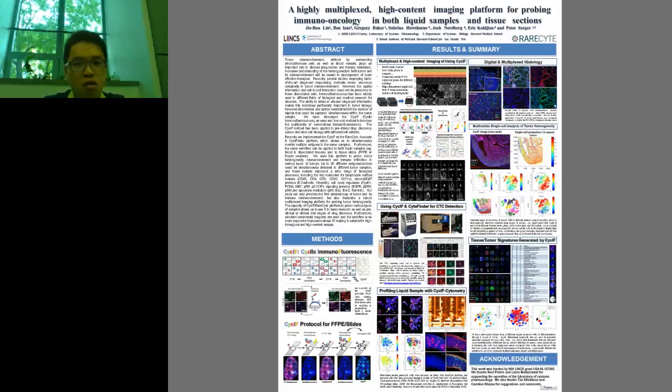So here is an undissociated mouse spleen. You use the same type of antibody and probe it again, and you can extract the single cell data from this intact tissue. Now you not only have the single cell data, but also rich spatial information. For example, you can see a clear cluster of the signal together. Now you can see what kind of different clusters are in different regions.